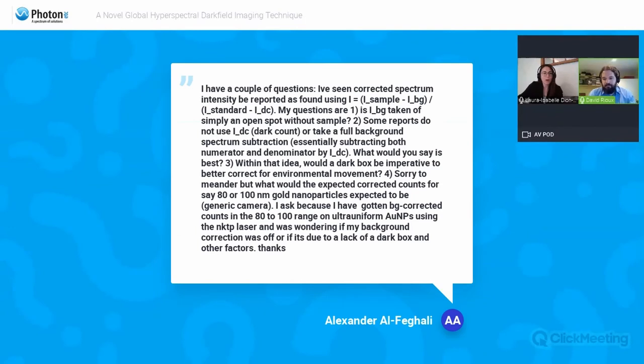Thank you, David. So I will publish a rather long question, and David, if it's okay with you, I will let you read it. And while you assess this question, I'll look at a shorter question that I might be able to answer quite rapidly. So we got a question from Revia, I think from Taiwan, that asked us if we needed to calibrate the filter. So yes, there's a need for a spectral calibration before starting the overall acquisition, but it's not something that you need to do every week. Once the filter is calibrated, you're okay for a couple of months, and even more than that if you don't change the configuration, if you don't move the LLTF around.